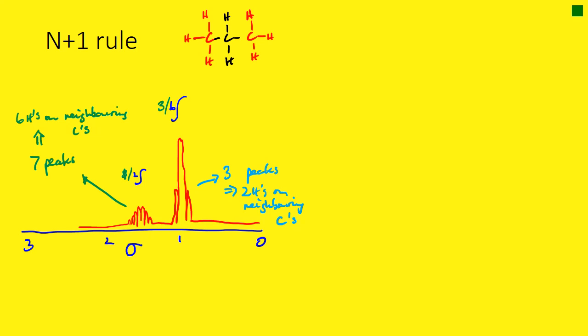As you can see, we've got a chemical shift of slightly less than 1. Let's call that 0.9. You could look up in the table and see that's hydrogens in a CH3 group of an alkane. And you could look up the other peak, the one that we've drawn in black, and see that's hydrogens in a CH2 group of an alkane.